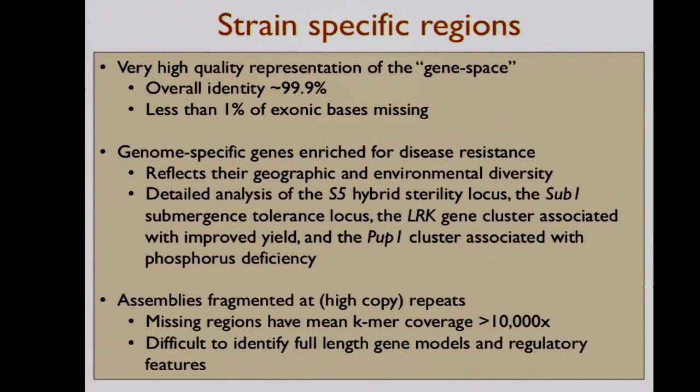I don't want to go into too much of the plant biology. So what did we learn from this? Overall, we had really good representation of the genes. We had almost all the exons assembled. Many of the gene models that we expected to find were present. We found some interesting stuff.